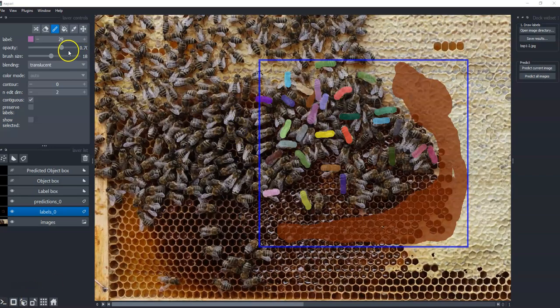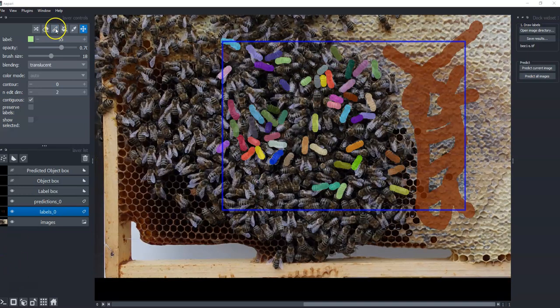So I've sparsely labeled bees, and now I'm thinking, you know what, I want to go back, make some more background. So I'm changing this back to 1, making some background, make the brush bigger for the background. There we go. A little more background here, a little more background maybe here, maybe get a couple of the corners. Okay, a few more bees in the corner here. I did a lot of them off video. Yeah, then we got some sparse bee annotations.